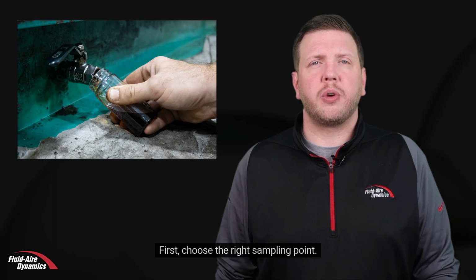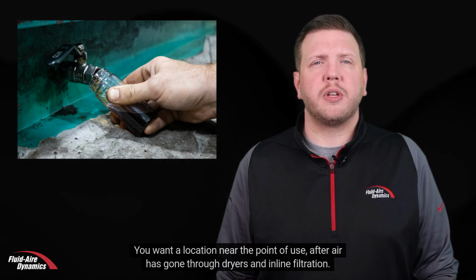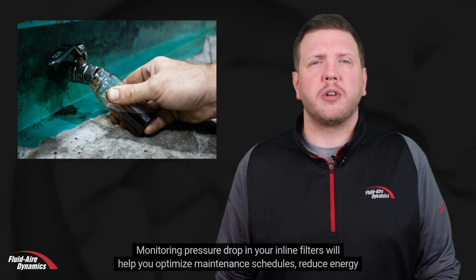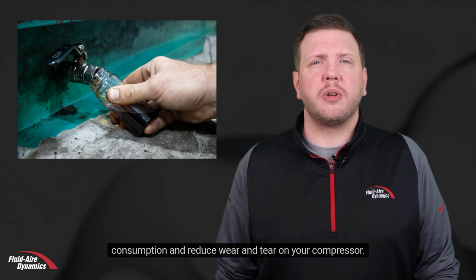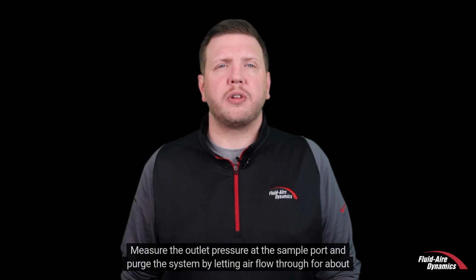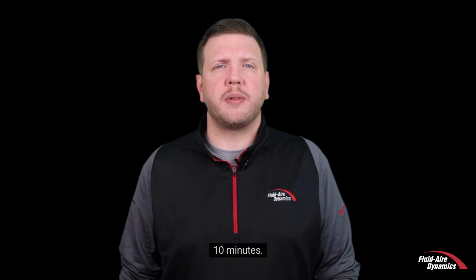First, choose the right sampling point. You want a location near the point of use, after air has gone through dryers and inline filtration. Monitoring pressure drop in your inline filters will help you optimize maintenance schedules, reduce energy consumption, and reduce wear and tear on your compressor. Measure the outlet pressure at the sample port and purge the system by letting air flow through for about 10 minutes.